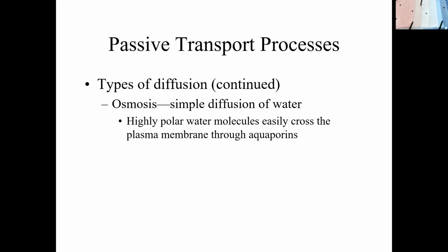So 0.9% sodium chloride is 99.1% water. If you look at it from a 100% basis, if you know that the concentration of the salt is 0.9%, then the amount of water in that solution is 99.1%. That's just how you mix these things up.